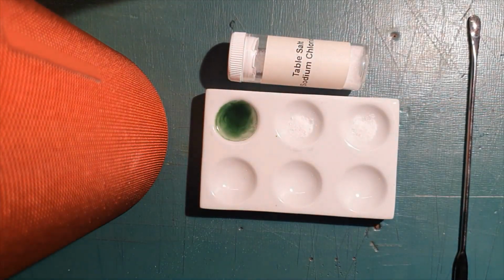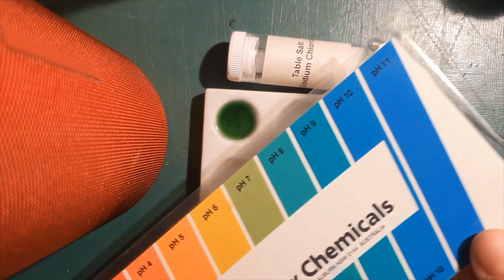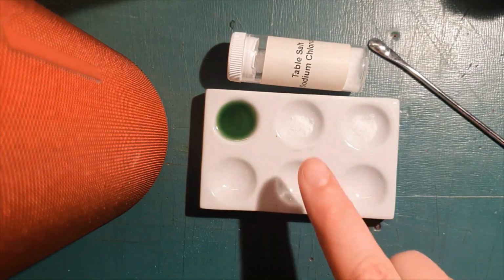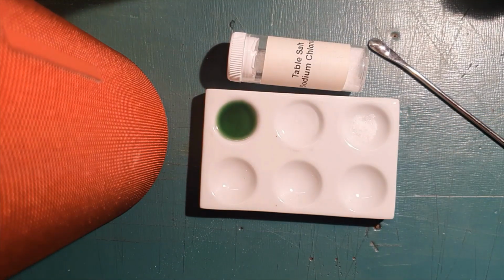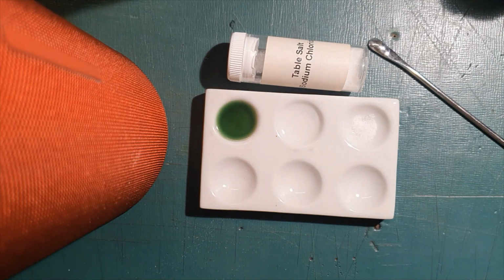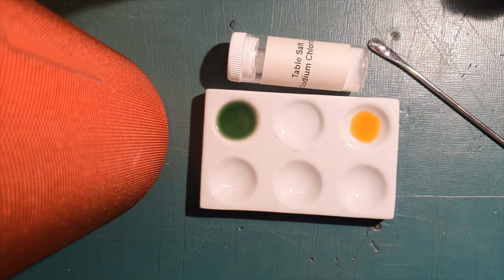Okay. So the first thing is dissolve it in some water. Universal indicator. pH. What does it look like? pH of salt. Next one, test some salt with some vinegar. Is there a reaction? No, doesn't look like it. Iodine. Does salt react with iodine? No, negligible. Cool. Let's move on. Citric acid is next.